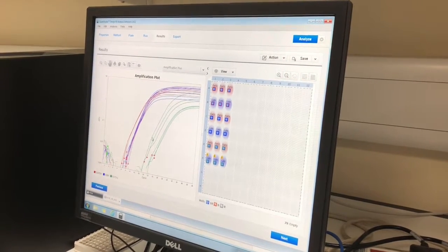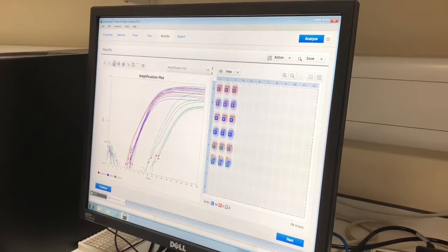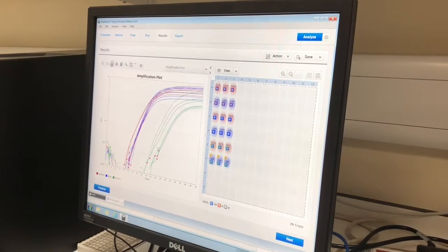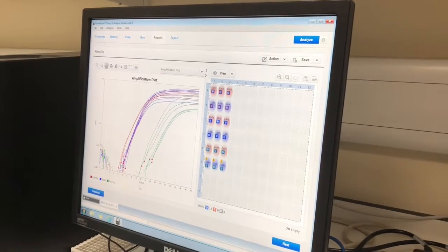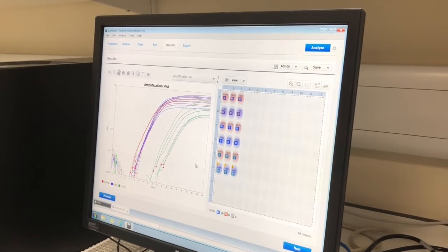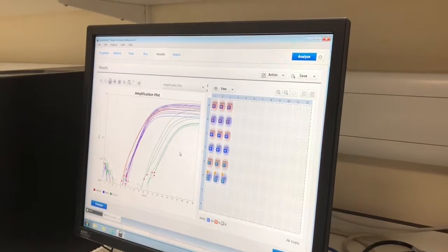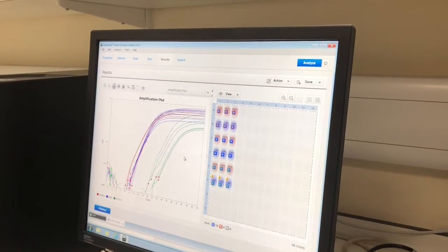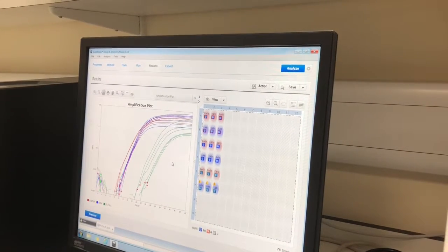So the machine measures this increase in fluorescence as the cycles go along, and then these samples here have a higher amount of the genes expressed, and these have a lower amount of the gene expressed because they take longer over the 40 cycles to reach a certain threshold to show us how much of that gene is expressed in those samples. So we take our DNA from our patient blood samples and compare it to the healthy controls, and then this can tell us information about what's going on in those patient cells and help have more information about what's going on with their disease.